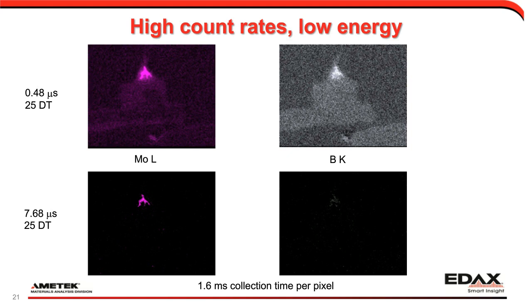And no matter how much you filter it, you're not going to see the gradients in there. It's not magic, it's not TV where we can just zoom into an image and generate artificial pixels. The data is what the data is. And at high count rates, you get better statistics to the point where you can actually see what is going on in the sample.